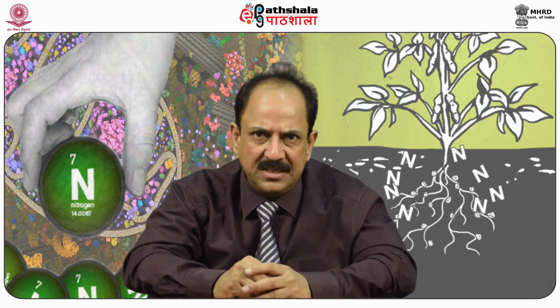Therefore, let us use these two HPR proteins, that is one from E. coli K12 and other from E. faecalis V583. Download these protein sequences and save in separate files named E. coli HPR.fa and E. faecalis HPR.fa respectively.